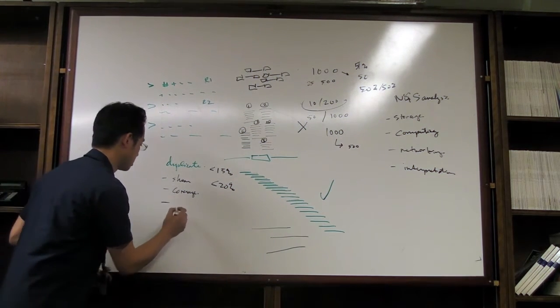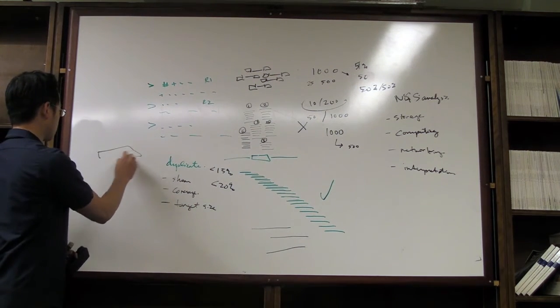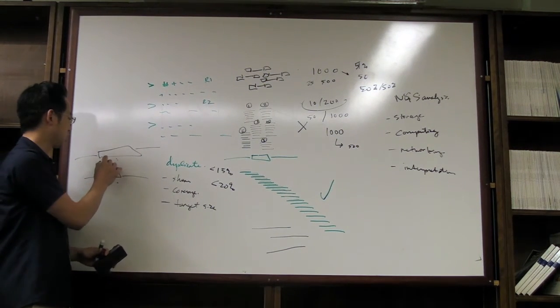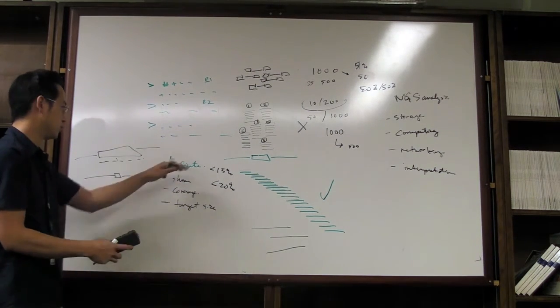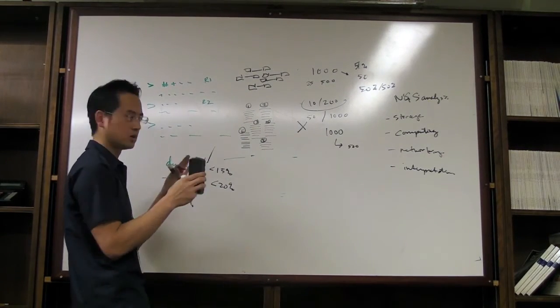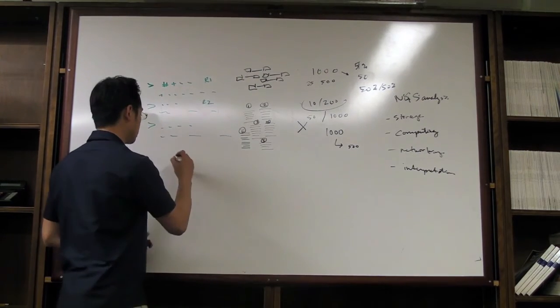And then the one final thing is also the target size. So if you're targeting a large exon versus a tiny one, you're going to get way more duplicates here versus here, right? More chance for random things here, less chance for random things here. So duplication rate is good to analyze. Let's say you do it and, yep, you get a low duplication rate, a good complex library. The next thing you want to do is called trimming.